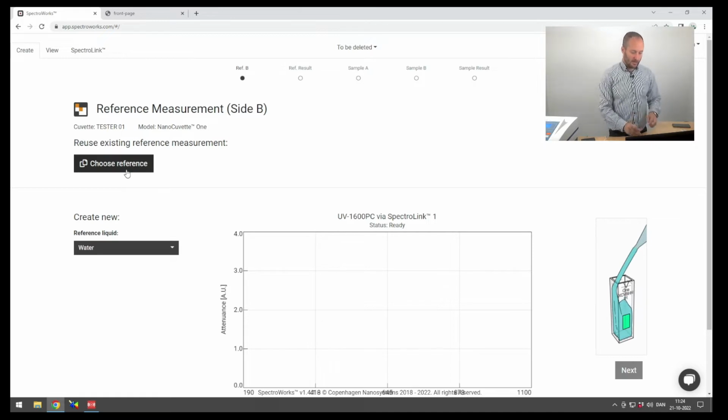The problem with loading your sample without doing the reference measurement first is that you will end up having deposits on the crystal. So you don't really know the quality of the crystal unless you repeat this first. The cleaning protocol is just DI water, shaking it to make sure you mechanically remove any residuals, and then you dunk it out, right? And then I load it with DI water again in order to measure how well we cleaned the filter itself.